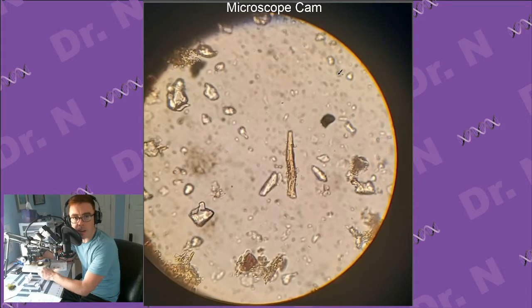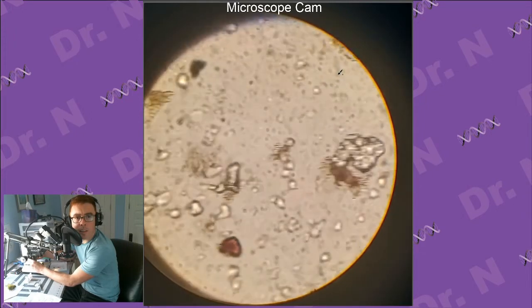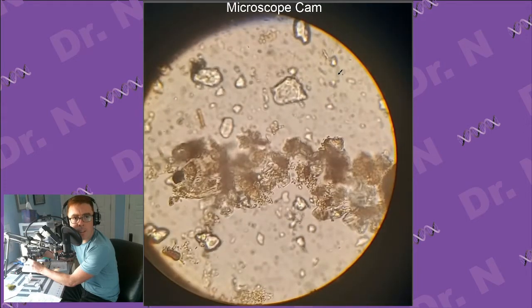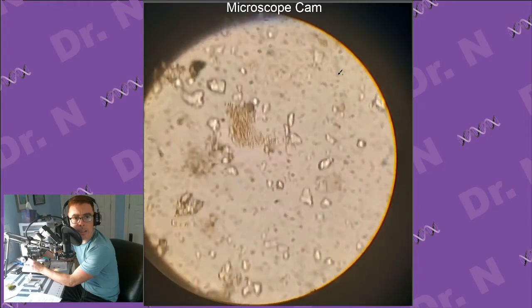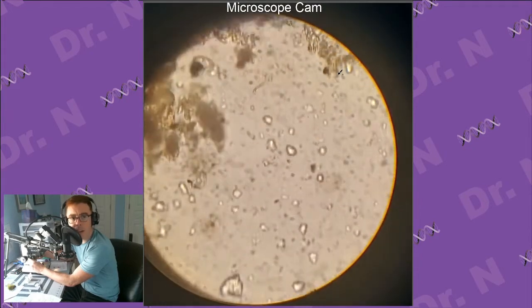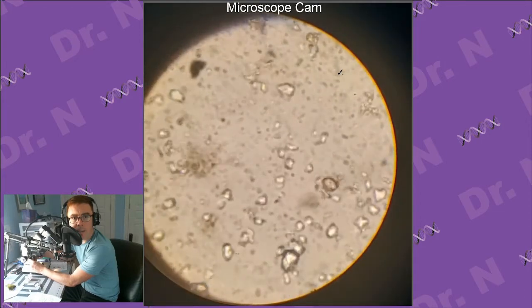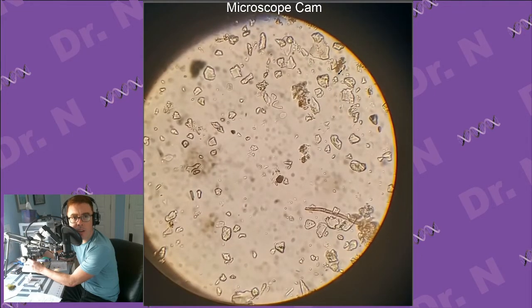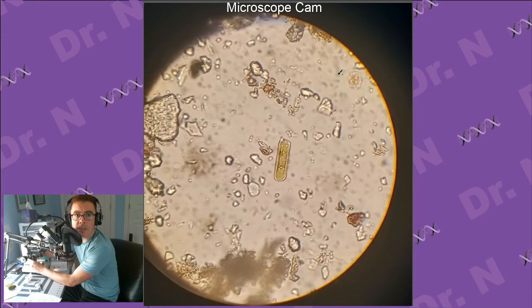All right, well, that rod-shaped thing is just a piece of dirt. But at least there's more stuff to investigate here. I am sort of shocked by how dead all of this stuff is. You hear that water bears live on moss and they're so easy to find and they're everywhere. Not to me. Oh, hey, that's something. What are you?